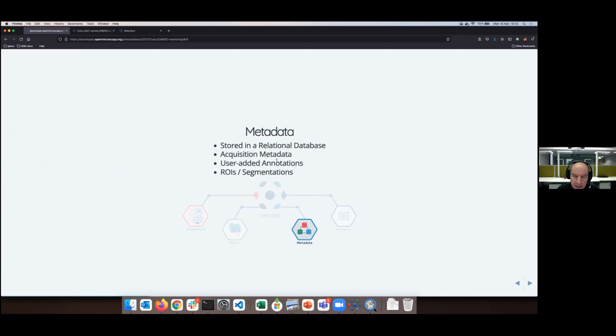So the metadata, which I highlighted, are important, and are of two sorts. First, the ones which are in the file itself, and then also the ones which you add post hoc, which you need to organize your images. And then, of course, also metadata which are coming from the analysis. So I will touch upon all of them in the course of the workshop.